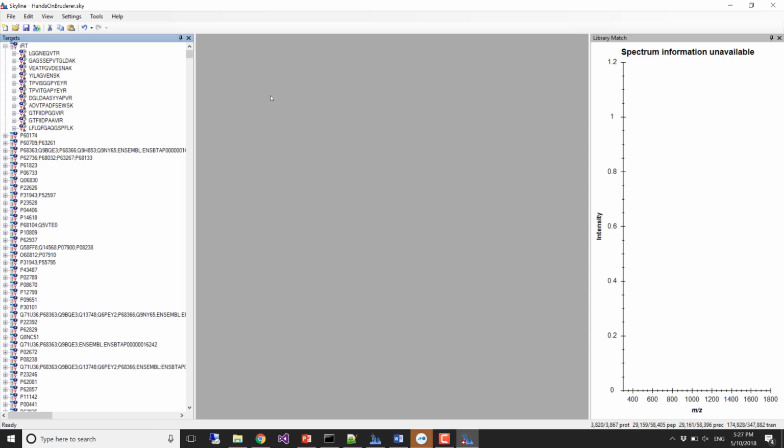I haven't given you any raw data, so go ahead and save this file. That's the end of working with this file because you don't have the raw data to import. You have that one raw data file, and you could import that on your own time. Or you can come to me and get the flash drive and get the full data set and try to process it on your laptop if you want.